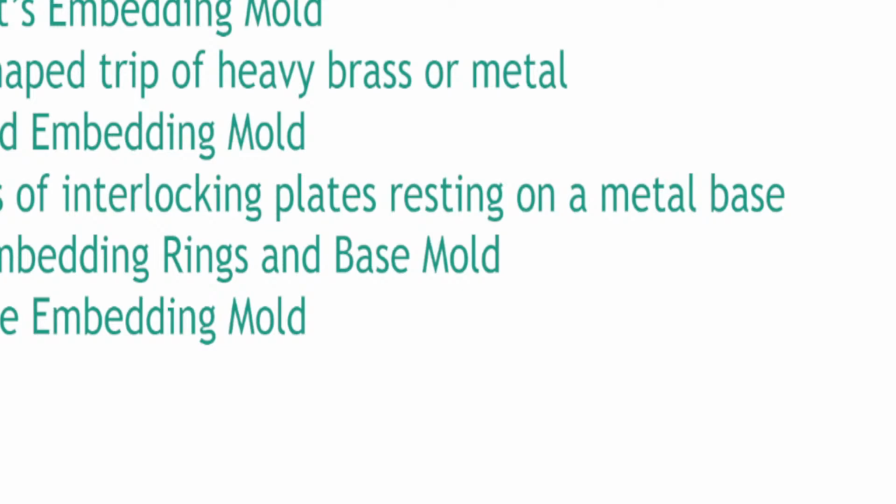I think most of the hospitals in the Philippines use this one because it's cheaper. Plastic embedding rings, very bougie. Rarely, I've not seen it in the hospitals I visited in the Philippines. Probably in the larger hospitals like Philippine Heart Center. I'm not sure, but I've only seen this in Saudi Arabia, in one hospital that I worked in. Disposable embedding molds, yung pinakamaarte sa lahat.